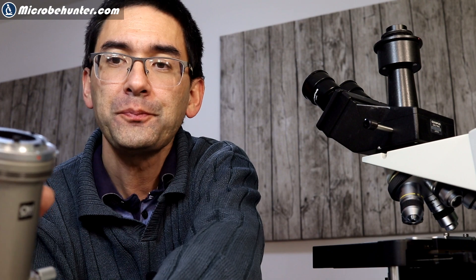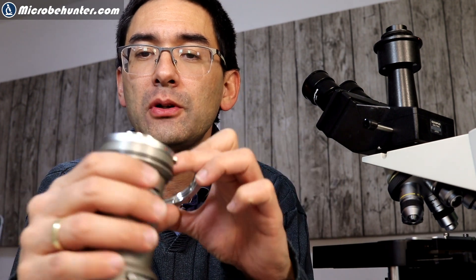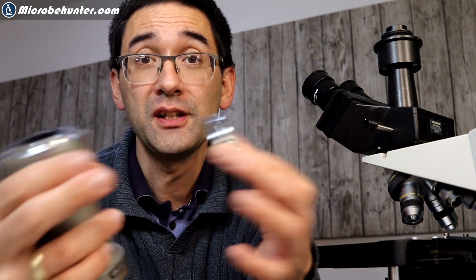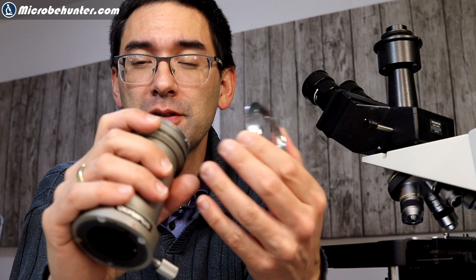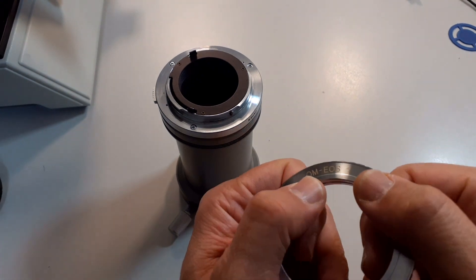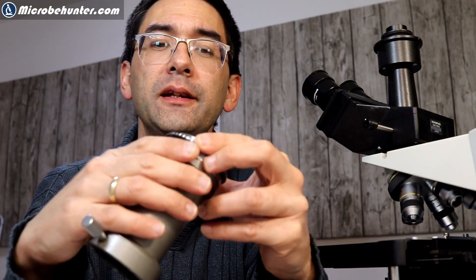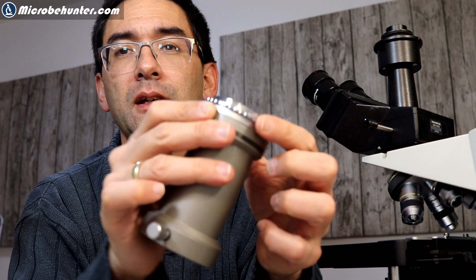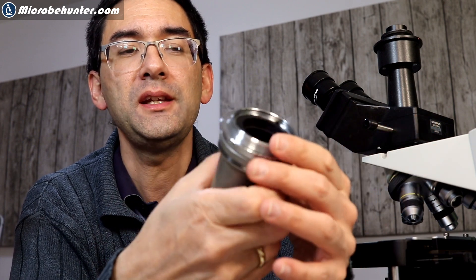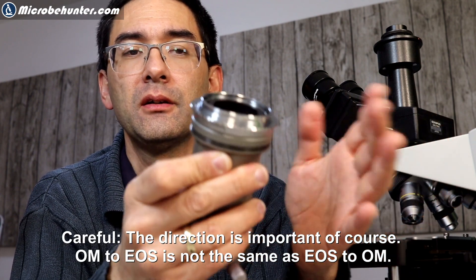For this there is also a solution. You need so-called secondary adapters which convert one camera system to the next. In this case it should work because the Olympus one is smaller than the Canon one. You get one of these, find the red dot, line it up, put it on here, and turn it — it locks into place. If you want to release it again, you press this button here.